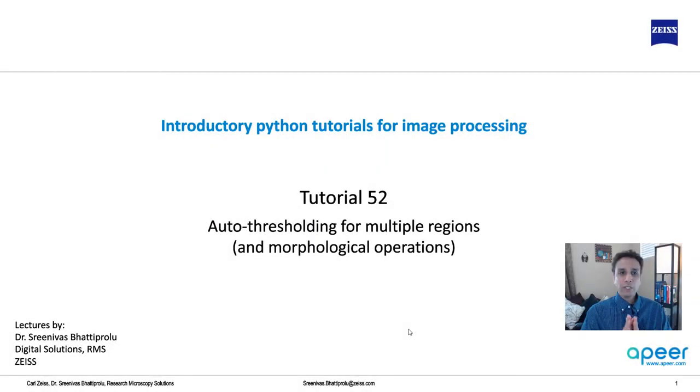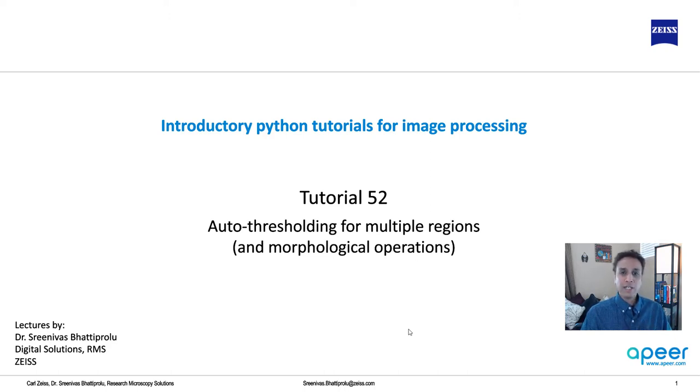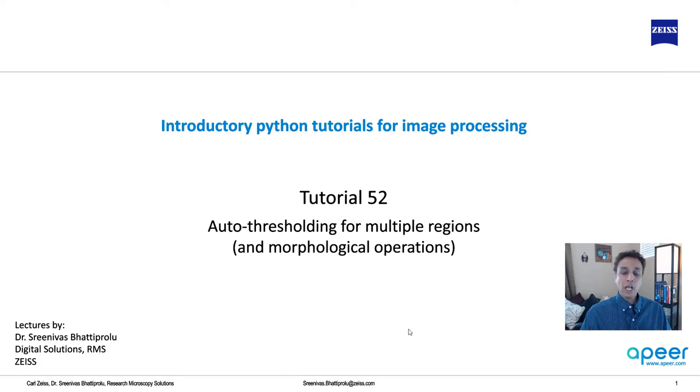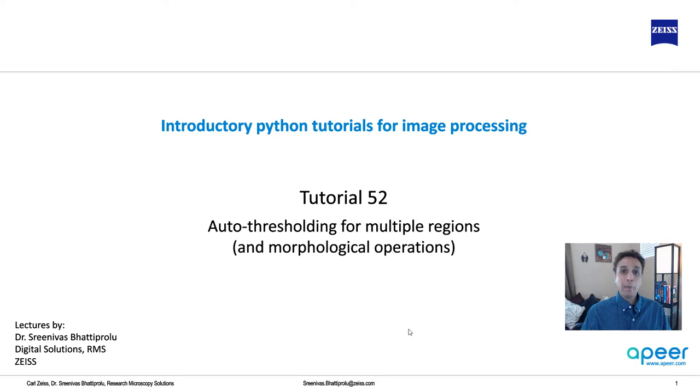Hi everyone, welcome to tutorial 52 of our introductory Python for image processing tutorial series. In the last tutorial we looked at thresholding and segmentation, how to do it manually and how to do it in an automated way, basically by using OTSU to automatically binarize your image.